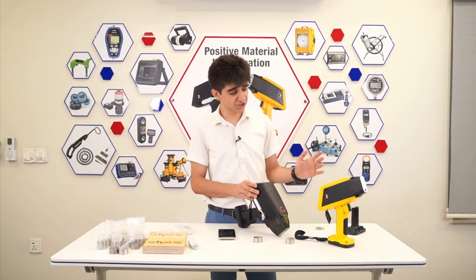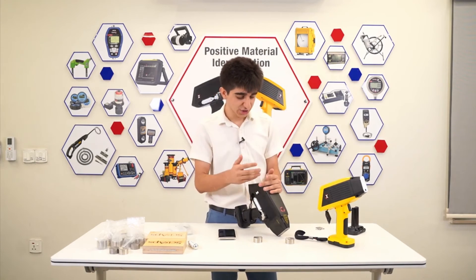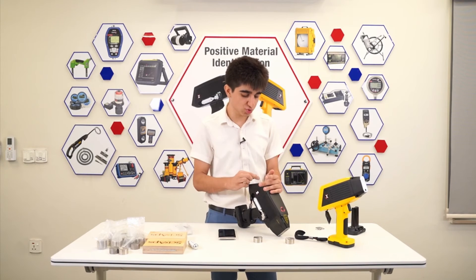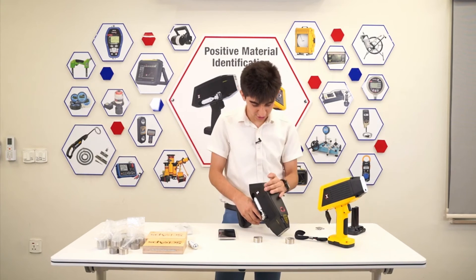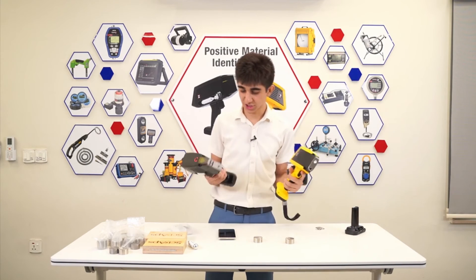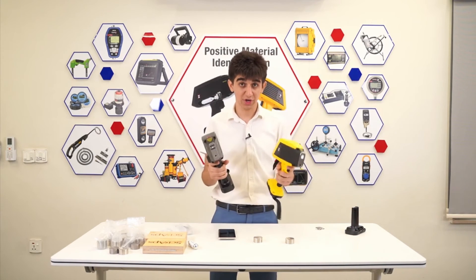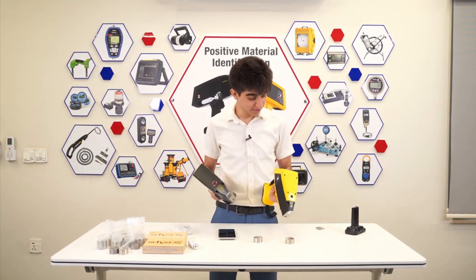Again, just like the X200, you can export the report right away — go to Share and send via Bluetooth. The units are pretty easy to use and very good for site use specifically — super lightweight.